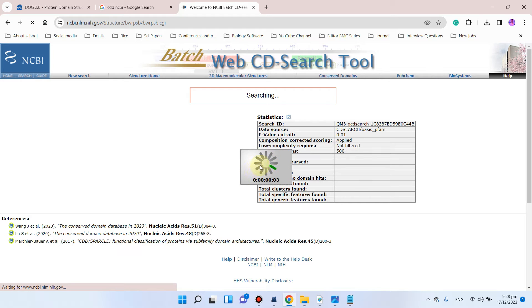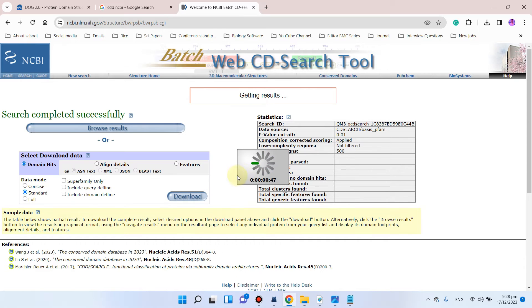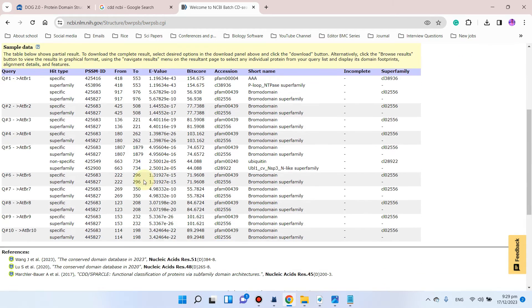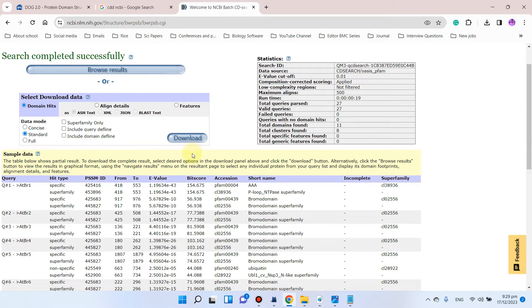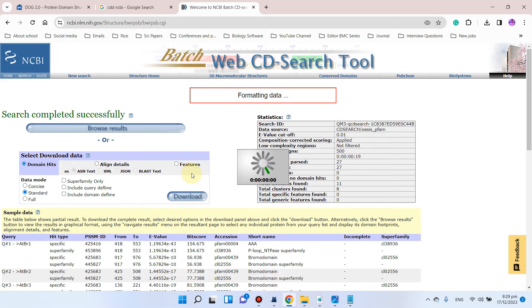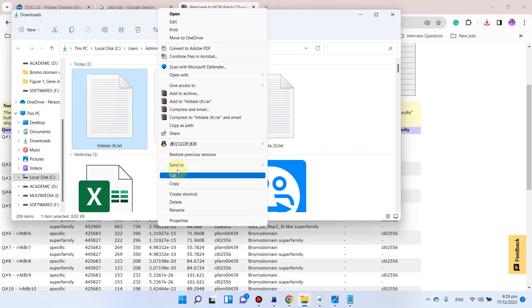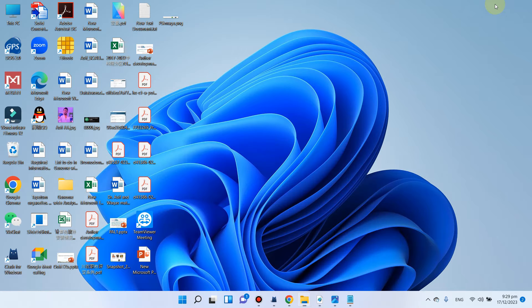The search is running and will take just a few seconds. Our results have started to appear. We've chosen standard data mode and are looking at domain hits. We simply click Download to download the hits data file, which takes a few seconds. Now it has downloaded and we can go into the folder.